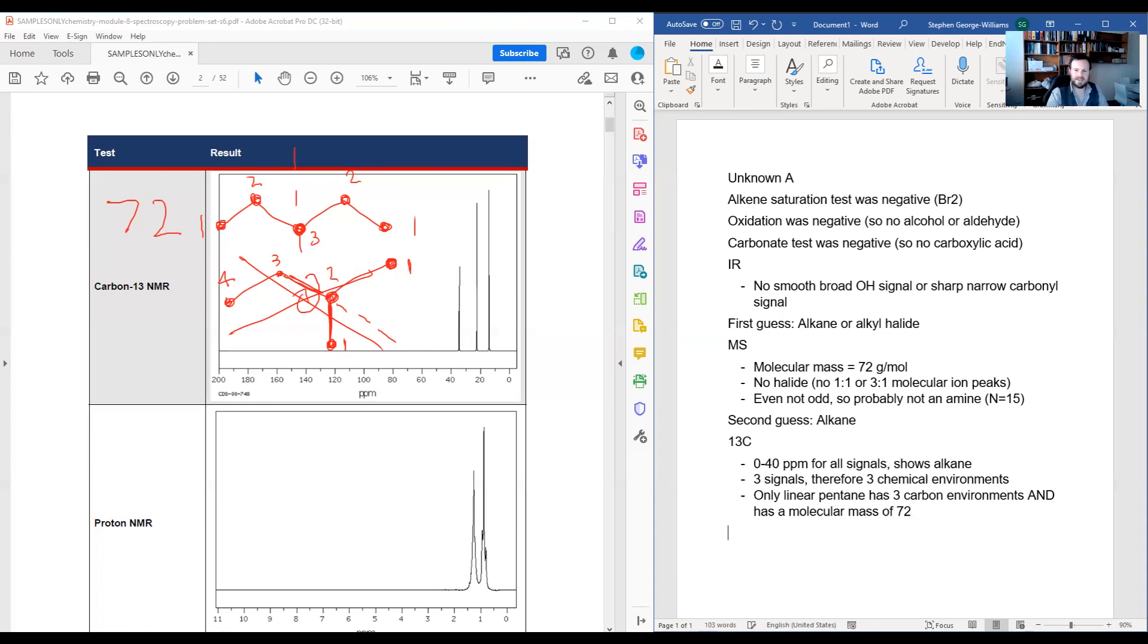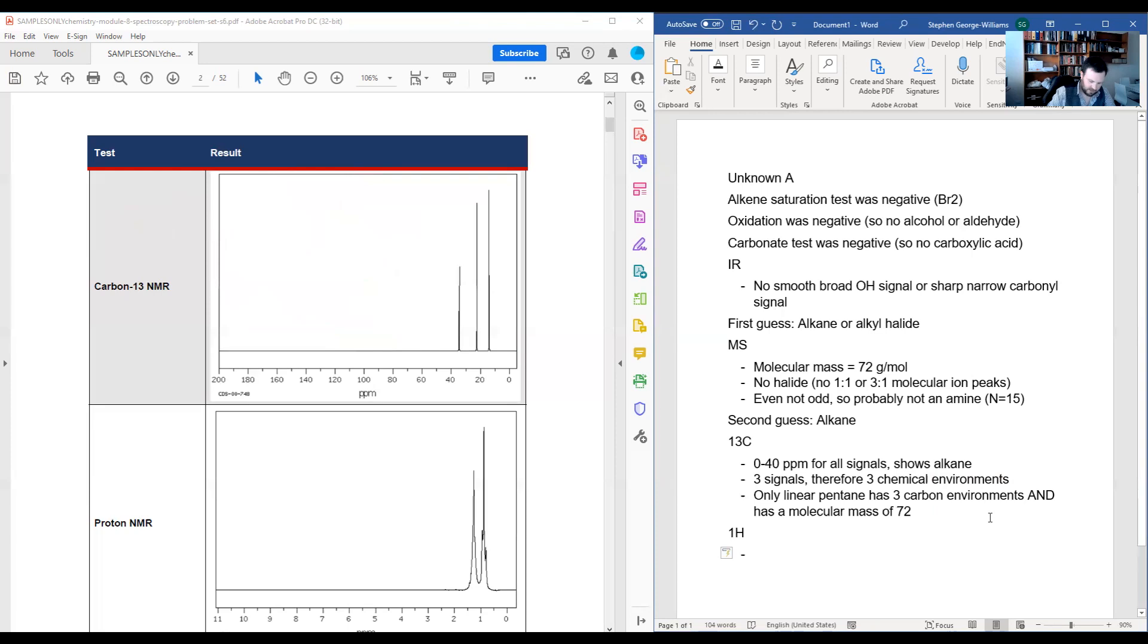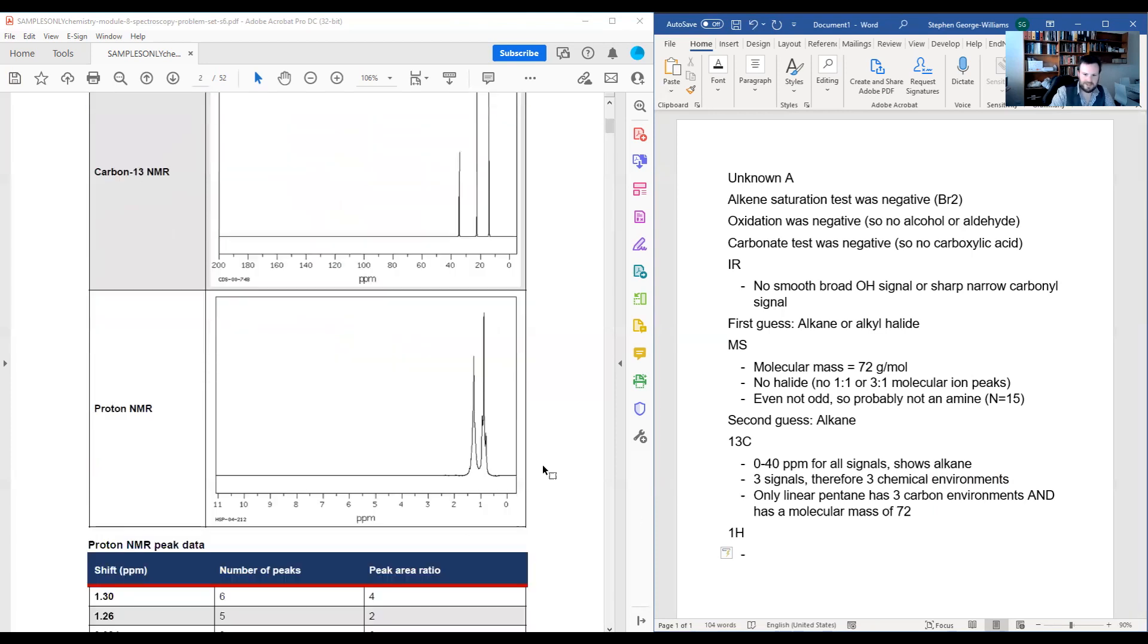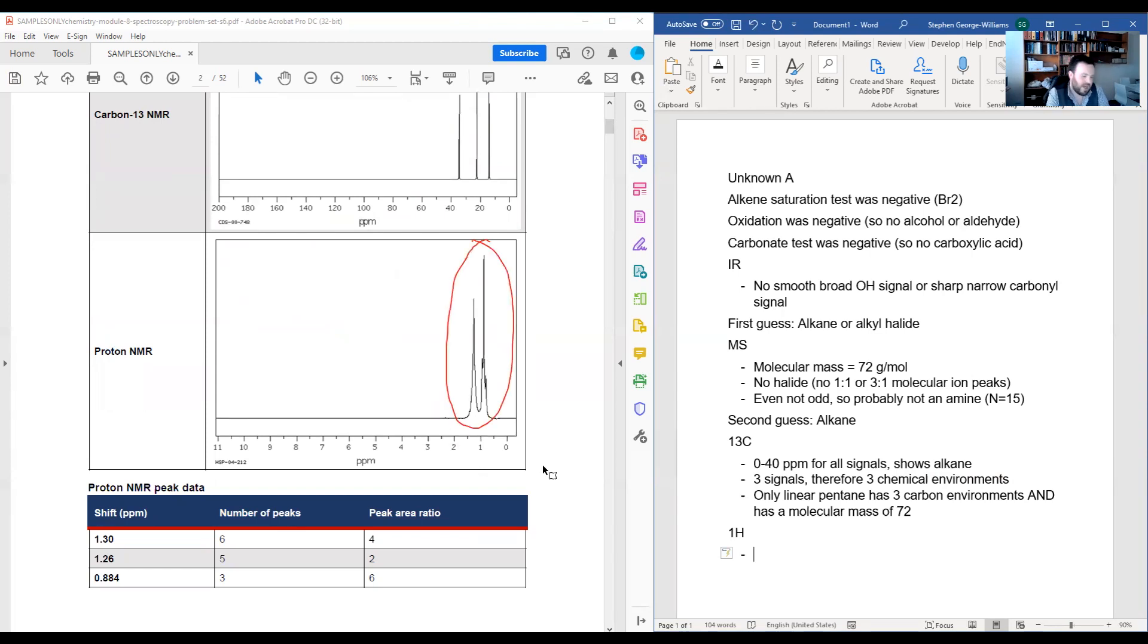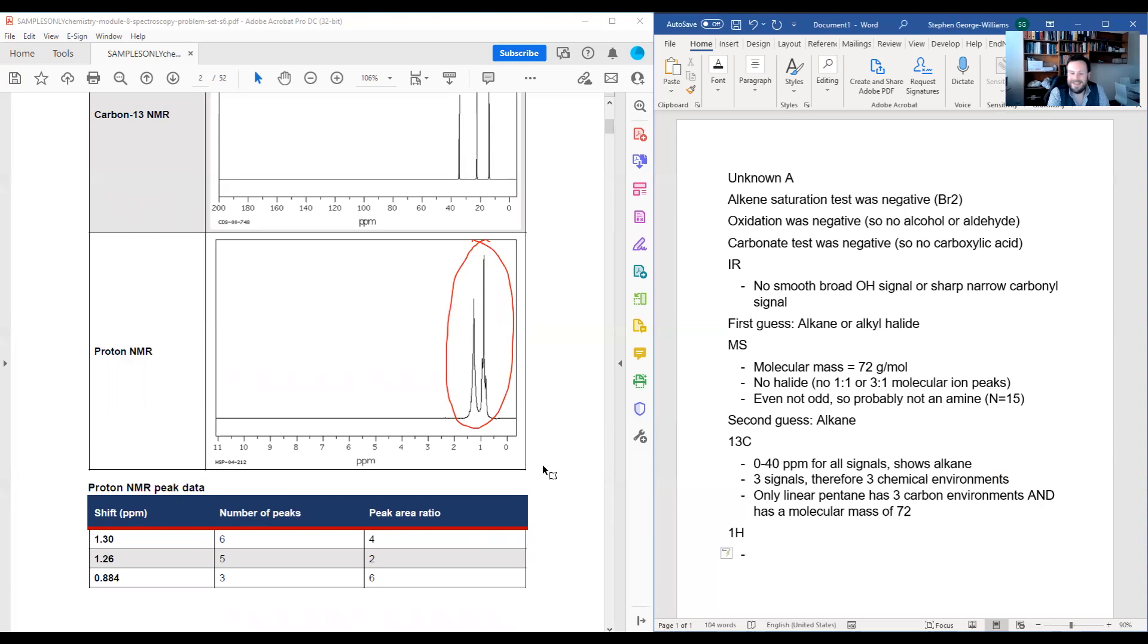One last thing I will look at is my proton NMR, at which point immediately you might cry a little because it looks awful. Often when we show you proton NMR, we show you really nice clean ones with clear singlets and doublets and triplets. This is unfortunately the real world, and pentane does not come up in those nice clear coupling patterns.